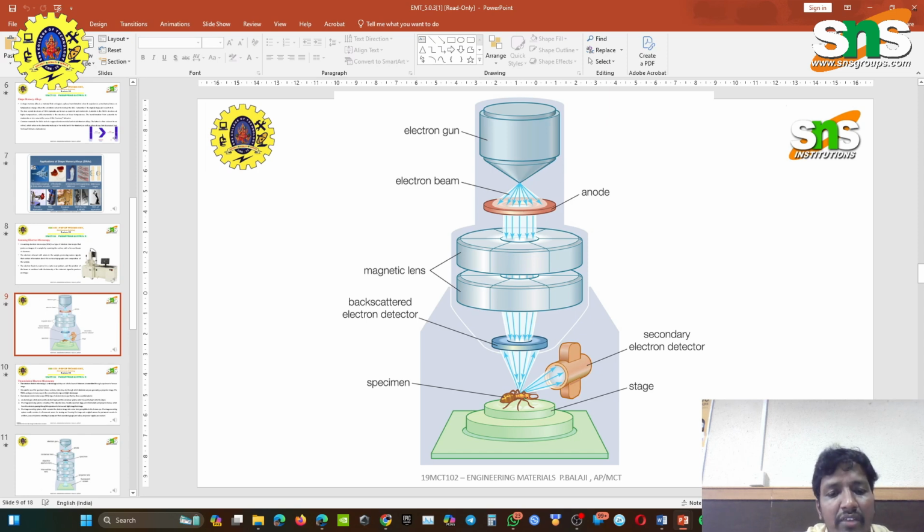The unique configuration of the SEM ultimately determines its resolution and available imaging modes. A wide range of solid materials can be directly analyzed using SEM, while biological materials and insulating samples often require specialized imaging, such as low vacuum or low kV imaging, to reduce surface charging. The samples can also be coated with a thin layer of gold or platinum to minimize charging.